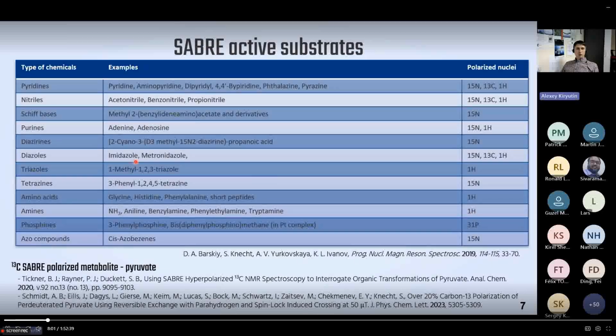This slide presents the growing list of the molecules that can be hyperpolarized using the SABRE method. In recent years, researchers have achieved significant results with the pyruvate ion, a crucial metabolite used in cancer diagnostics via carbon-13 MRI. The SABRE method is advancing rapidly. New target molecules for SABRE are being discovered each year. Chemists develop new polarization transfer complexes, including water-soluble iridium-based catalysts.